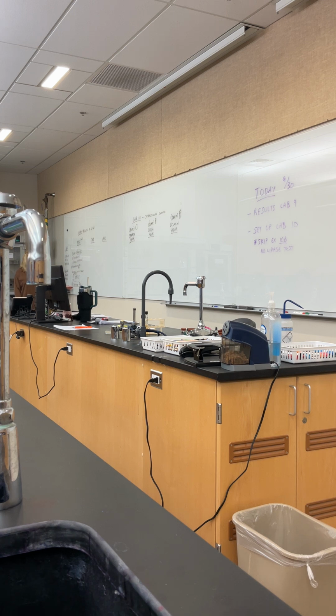And once I've separated them out, I'm making them look different. So I can tell pathogen from harmless strains. Does that make sense what's happening on this plate? If you're not sure, this is a good time to ask, but this is what we're looking for. Alright? Okay, so that gets us through our MSA.